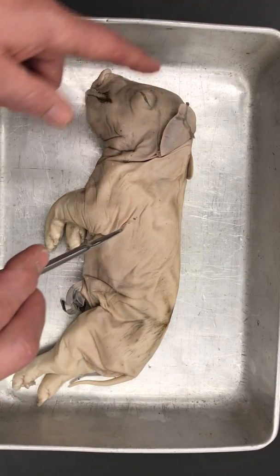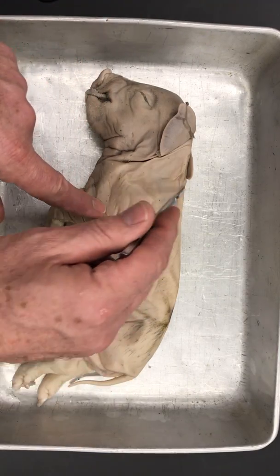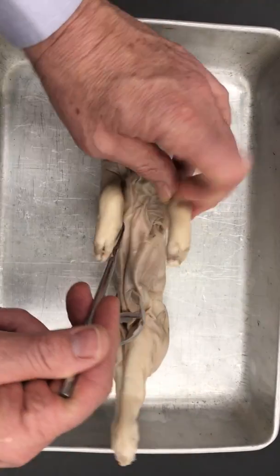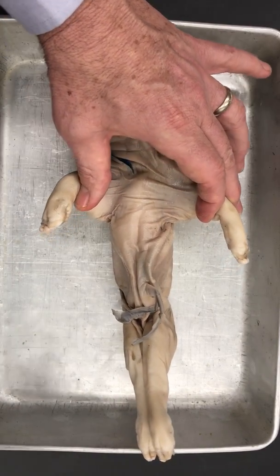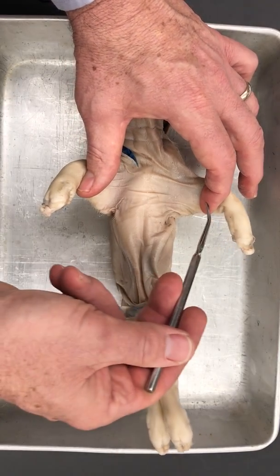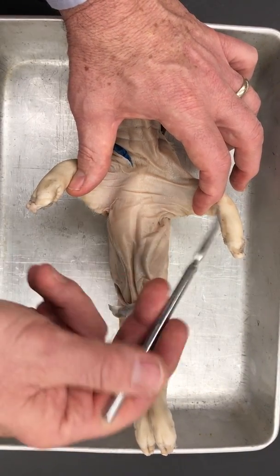Okay, then we have anterior and posterior, which are also pretty close to the same. They're a little bit different for people. We have dorsal, so the back, and the ventral, which is the underside, so like the belly of this guy. Then we have a term called medial, so that's toward the midline, and lateral, which means away from the midline. So those two terms are used to compare one spot to the other.